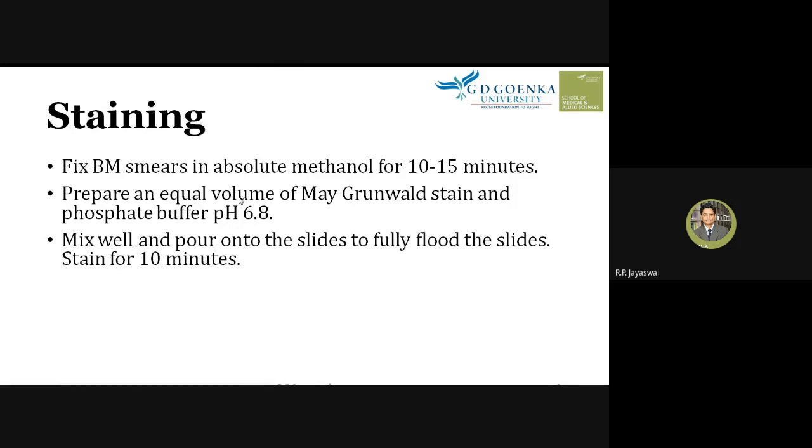After that we have to pour the mixture on the slides that contain the smear, so that the smear is covered properly. Flood the slides fully, and stain for 10 minutes. So completely flood the mixture over the smear on the slide, and just wait for 10 minutes, so that proper staining occurs.